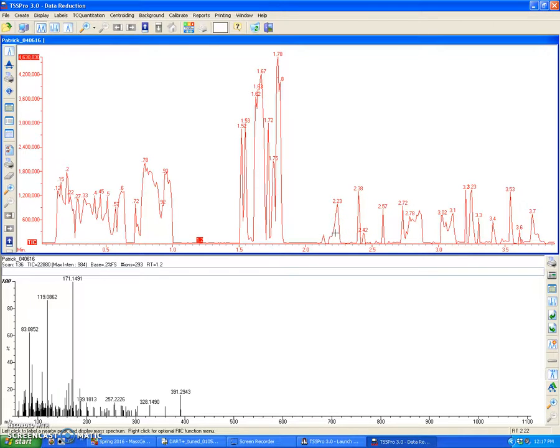This video will show you how to do more advanced techniques for mass analysis, such as having the software tell you where specific ions have been detected, or if you're looking at a specific ion and determining the elemental composition using a different software package.